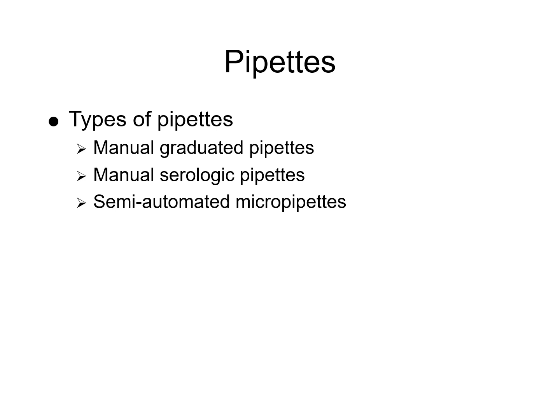For best practices for pipetting, always calibrate pipettes regularly according to the CLSI or manufacturer guidelines. We're going to use appropriate pipette tips to prevent contamination. We want to avoid air bubbles for accurate measurement. And we also want to label and store pipettes properly when not in use.